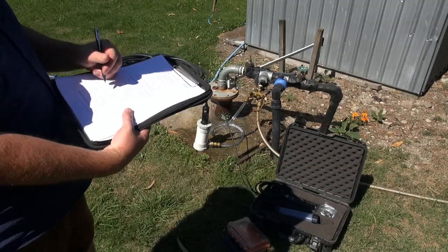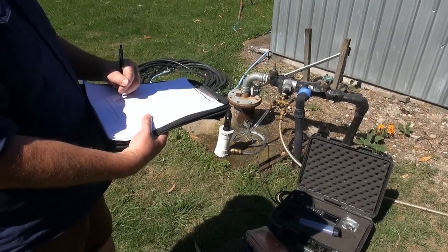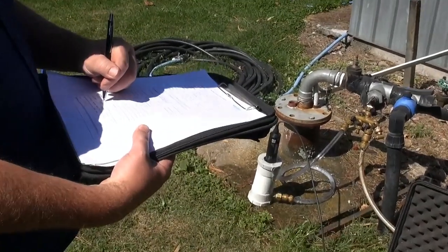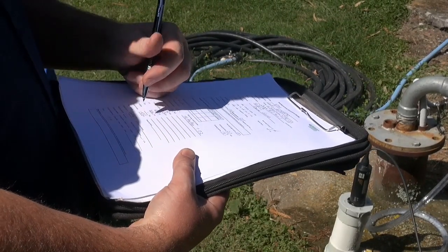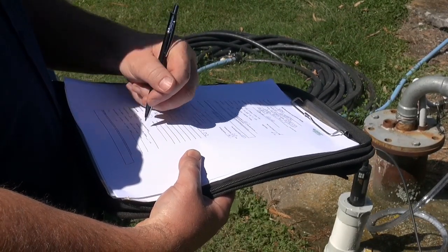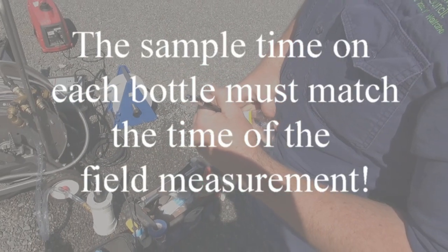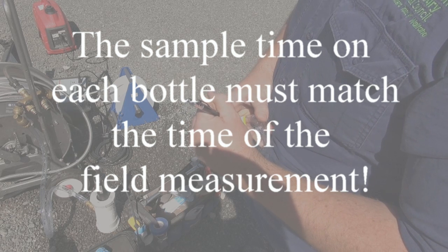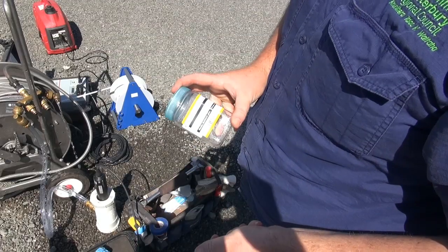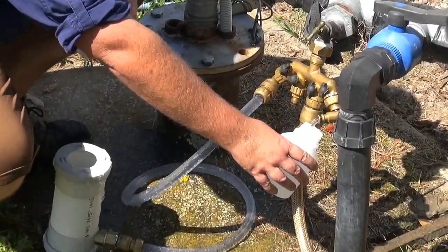For water samples: sample number, ID — it's two in this instance — is 20196834. Number of bottles will be four, field filtered yes. Time is very important for micro samples as they need to be analysed within 24 hours of collection. And of course you do your three-rinse procedure.